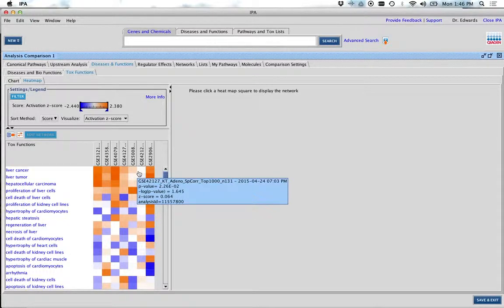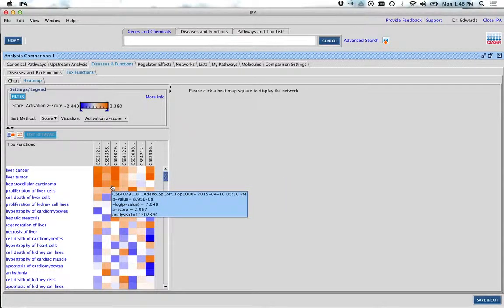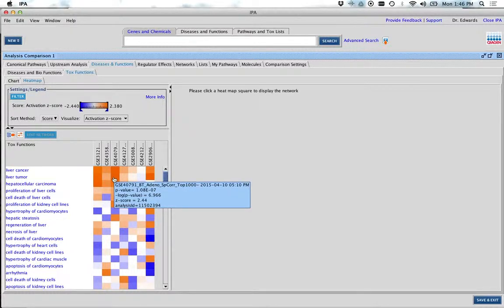Basically, what I'm showing you now, the fact that this doesn't look like a Jimi Hendrix poster or some tie-dye shirt, is showing that what we did worked. We expected to see a lot of cell growth in these cells because I just want to remind you what we did is we used mathematics to take a blind knife and cut off just a little bit of data on each one of those studies. Then from that little bit, we found out what was the common bit, and now we're analyzing it. And this is telling us all kinds of stuff.